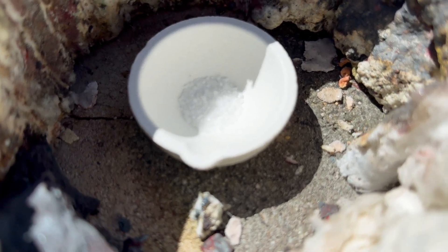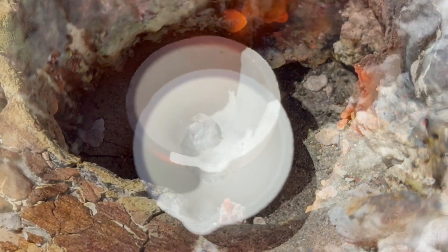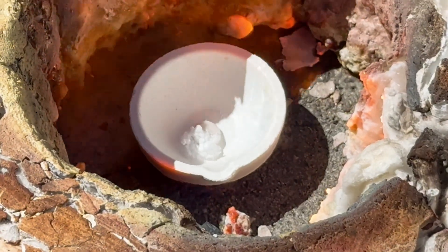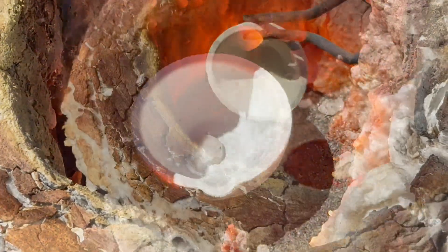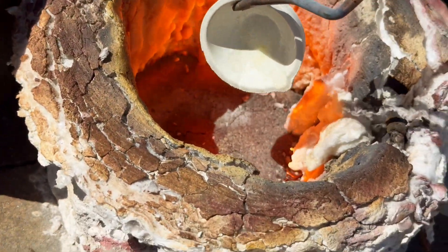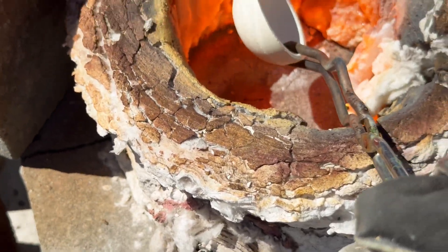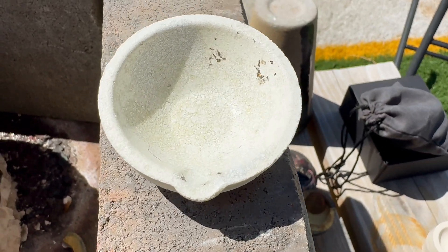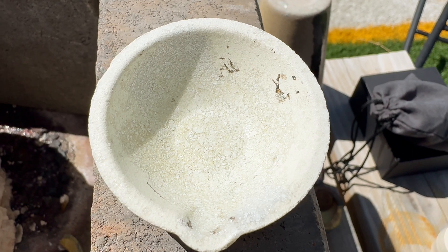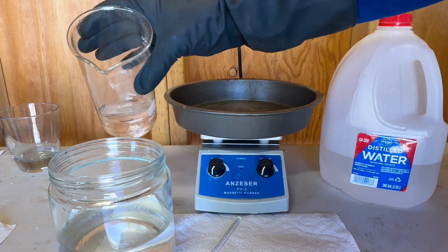Before we put our gold drop into our quartz crucible dish, I need to glaze it with some anhydrous borax. Glazing our quartz crucible dish with some borax will help the gold bead from sticking to the crucible dish. It's important to glaze the crucible dish as best you can, especially at the pour spout. Here is our finished product of glazing our quartz crucible dish. Let's get our gold drop into the glazed crucible dish.